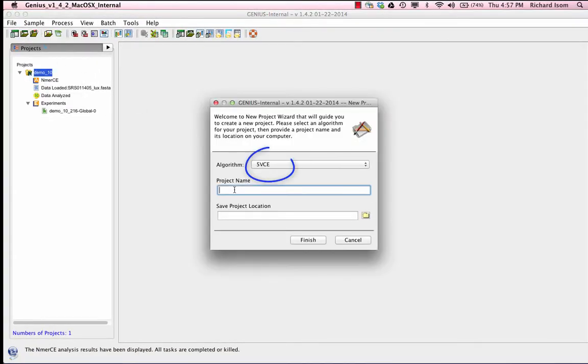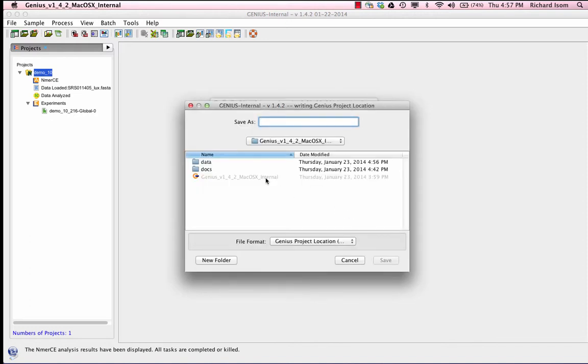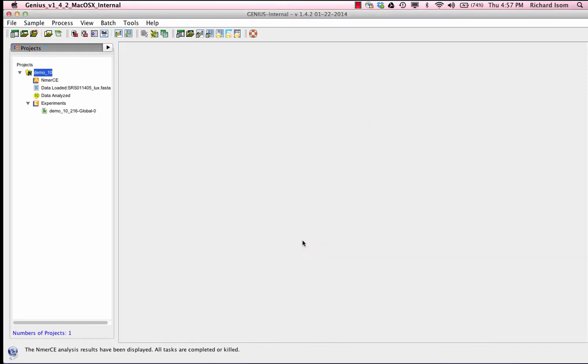Now let's look at our other algorithm, 5VCE, to see how it analyzes the same sample with comparable results. For the sake of time, we ran the sample beforehand and now we are going to retrieve the analysis output.